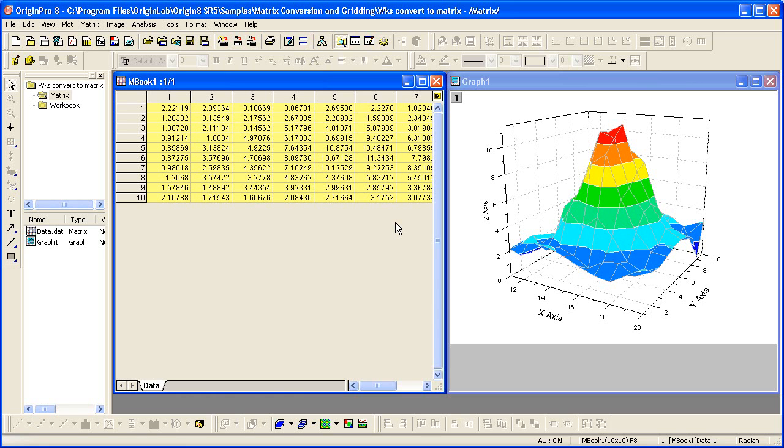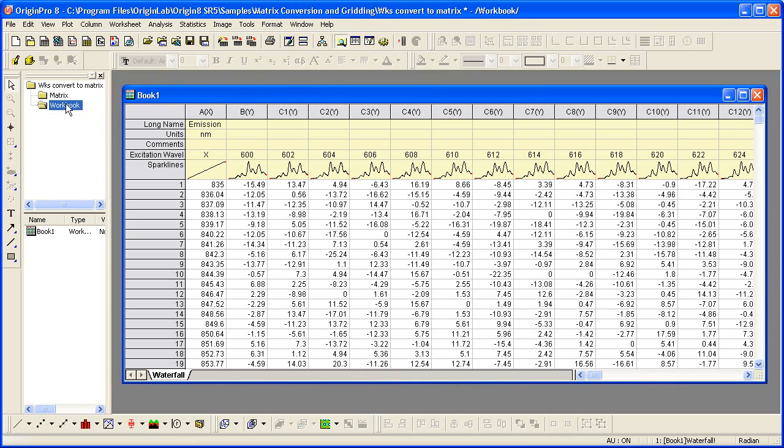Typically your data is first imported into a workbook, so we then need an easy way to convert it to a matrix form. In this tutorial I will show you how to convert worksheet data to a matrix when the X and Y values are present in the first column and one of the column label rows.